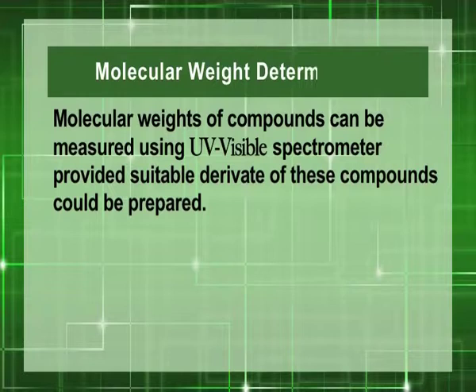Coming to molecular weight determination. Molecular weights of compounds can be measured using a UV visible spectrometer, provided suitable derivatives of these compounds can be prepared.